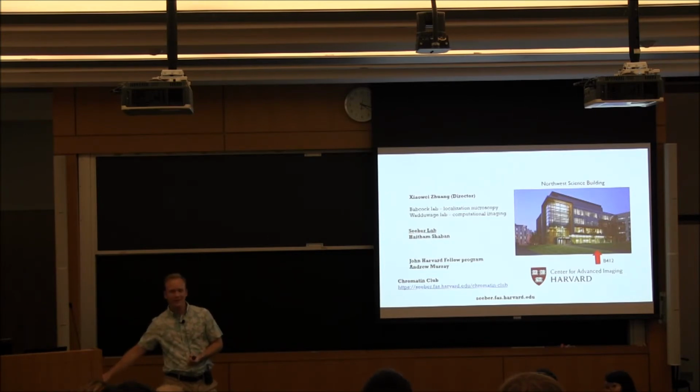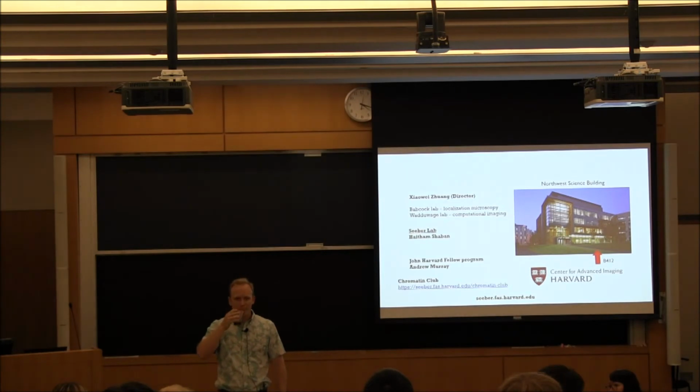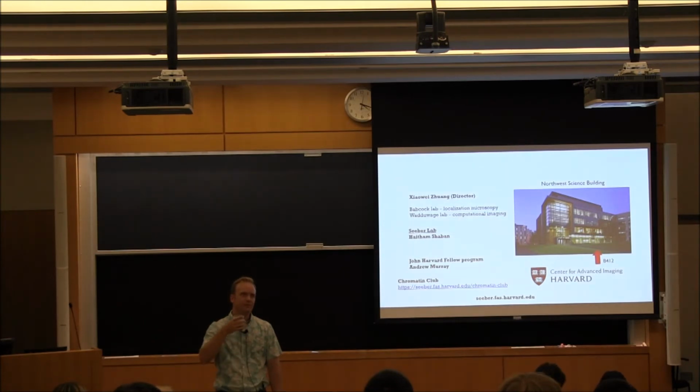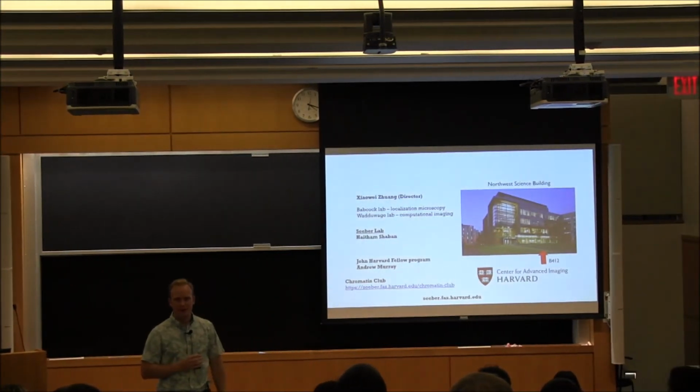Can you create segmented binary masks between data? Yep, you can actually. If you do that with Ilastik, you can load it in. So how did you generate a binary mask somewhere and you want to add it in? Yeah, you can do that already. I think you could already do it in KNIME without going the Ilastik route, but you could call that in.